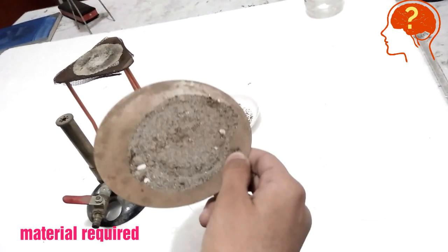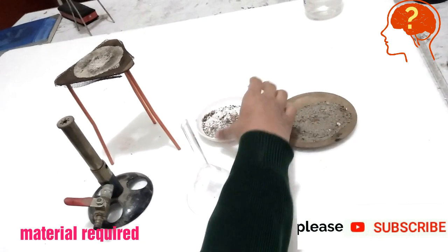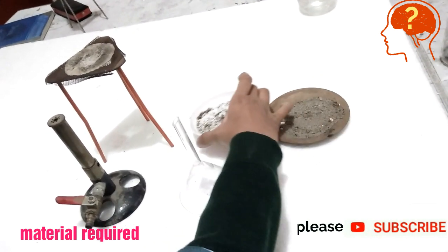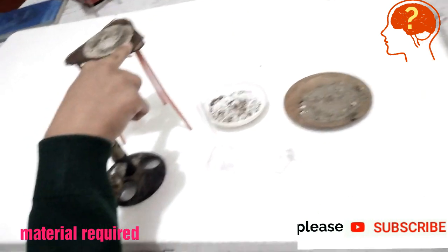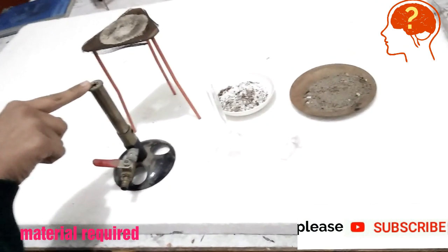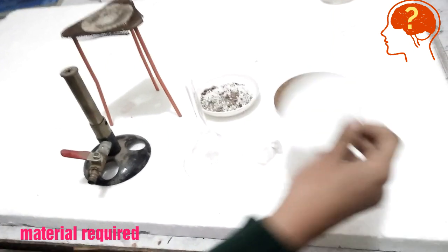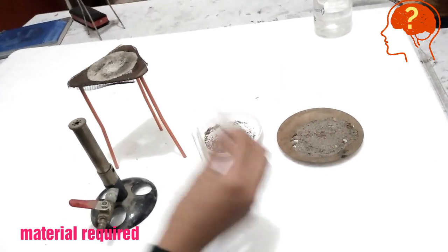you need funnel, sand bath having sand, china dish having mixture of sand and naphthalene, tripod stand, bunsen burner, filter paper and cotton.